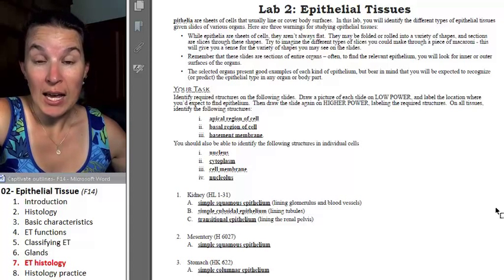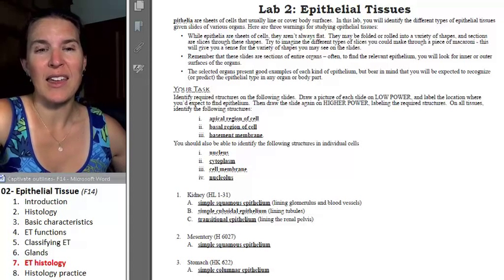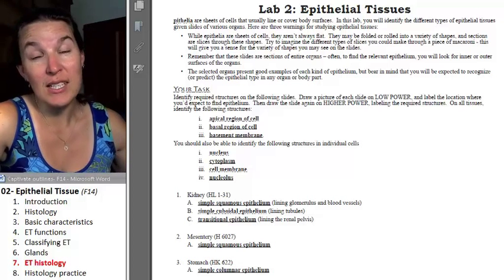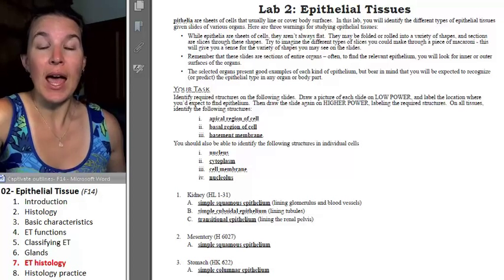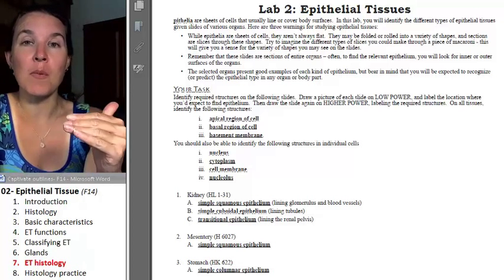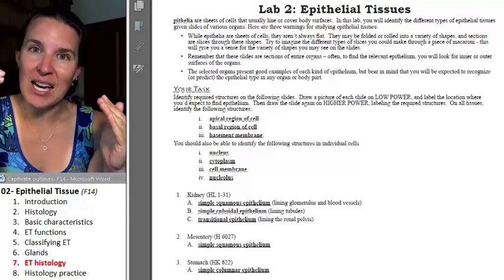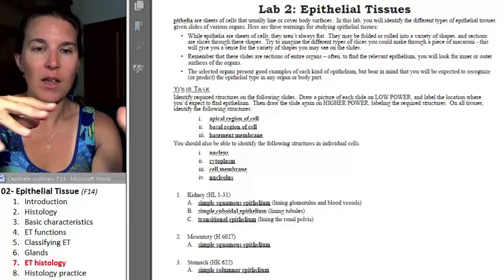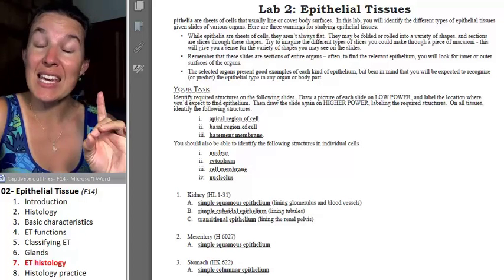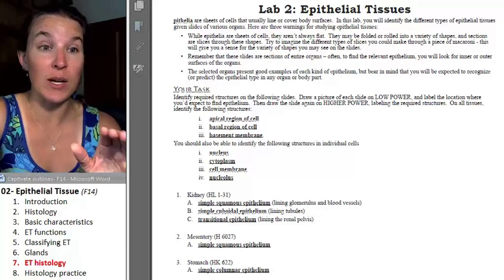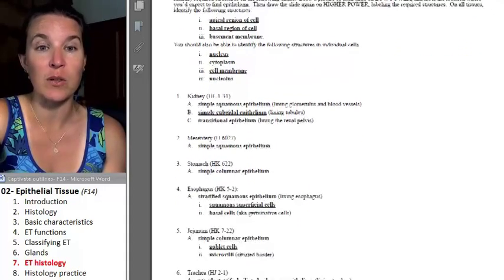In our lab today, we are looking at — I think there are five or six slides that you're going to explore. Your job with the slides is to find the specific kind of epithelia that is described, in addition to identifying any other epithelial structures that we've looked at.